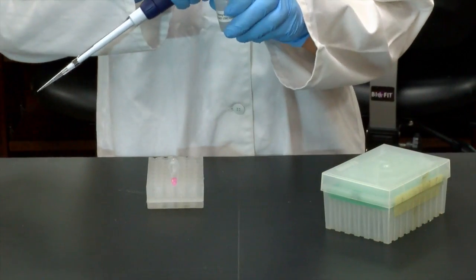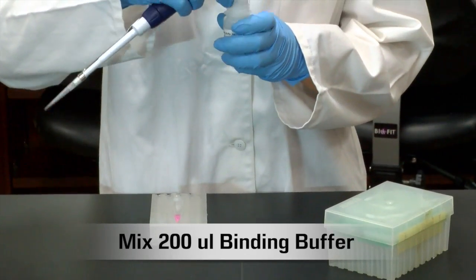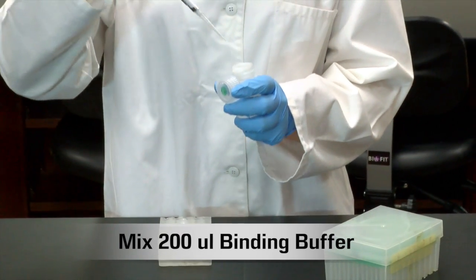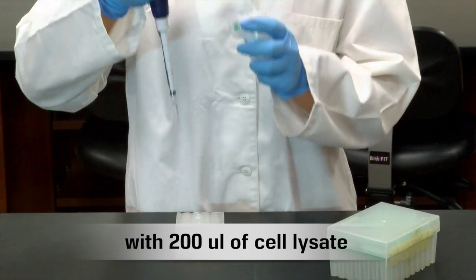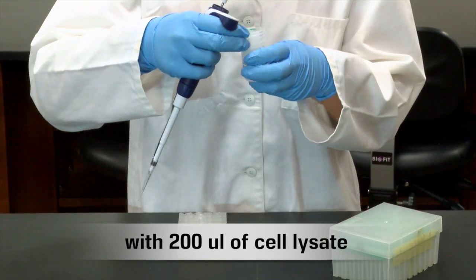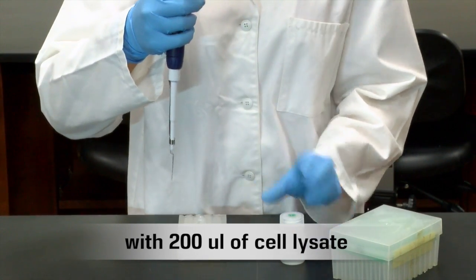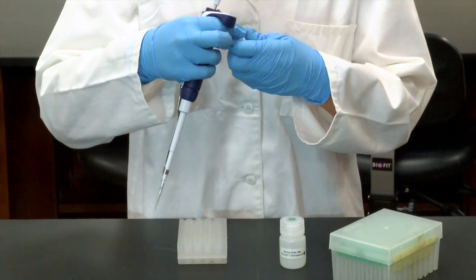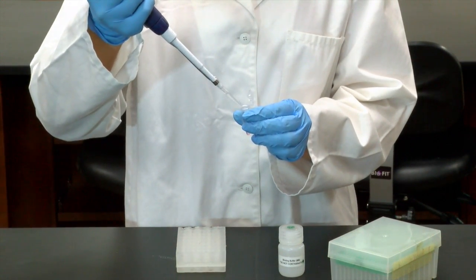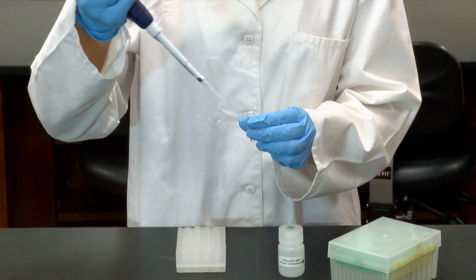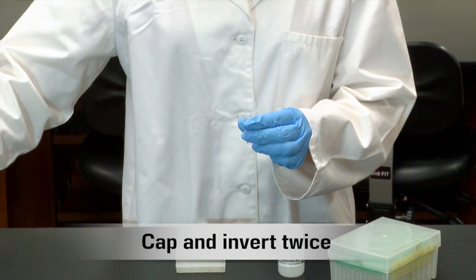One partner should prepare the protein sample. Obtain the microfuge tube containing the supernatant from the bacterial cell lysis. Add 200 µl of the binding buffer to the 200 µl supernatant. Cap and invert twice to mix well.